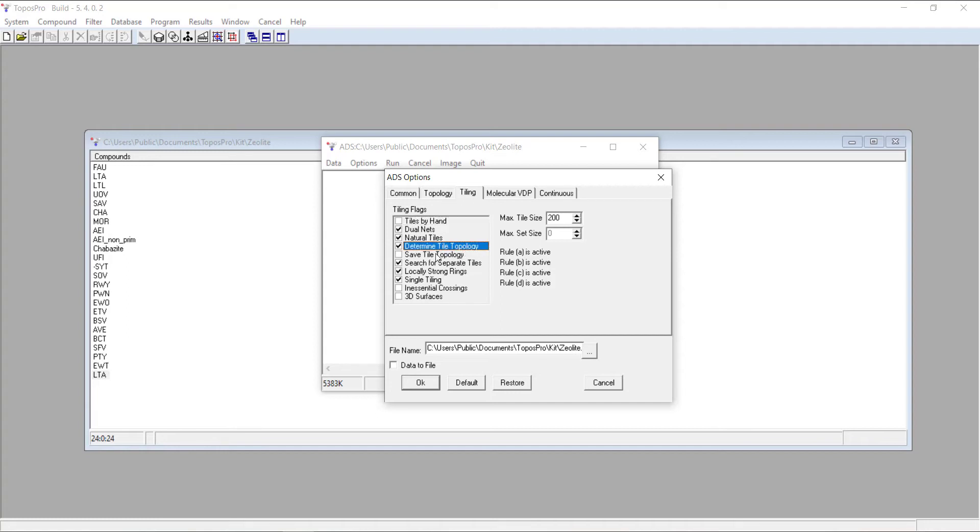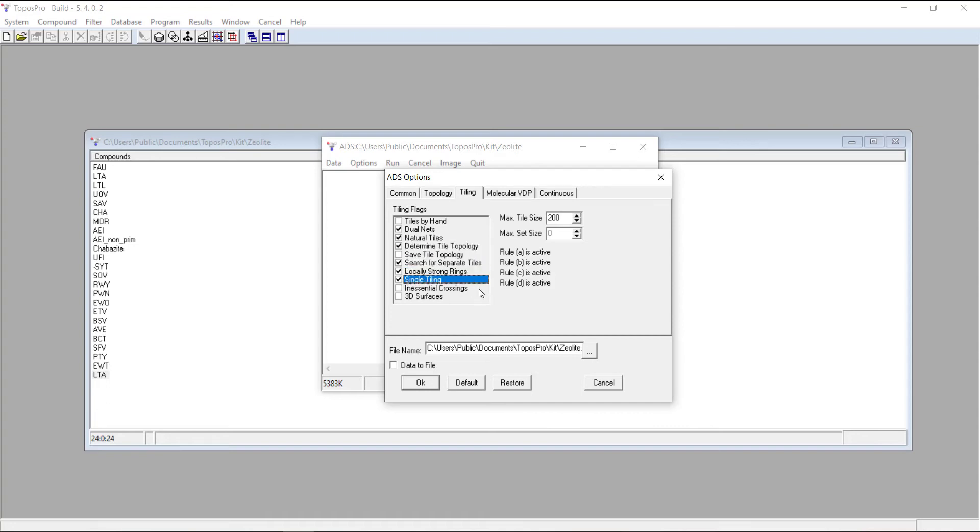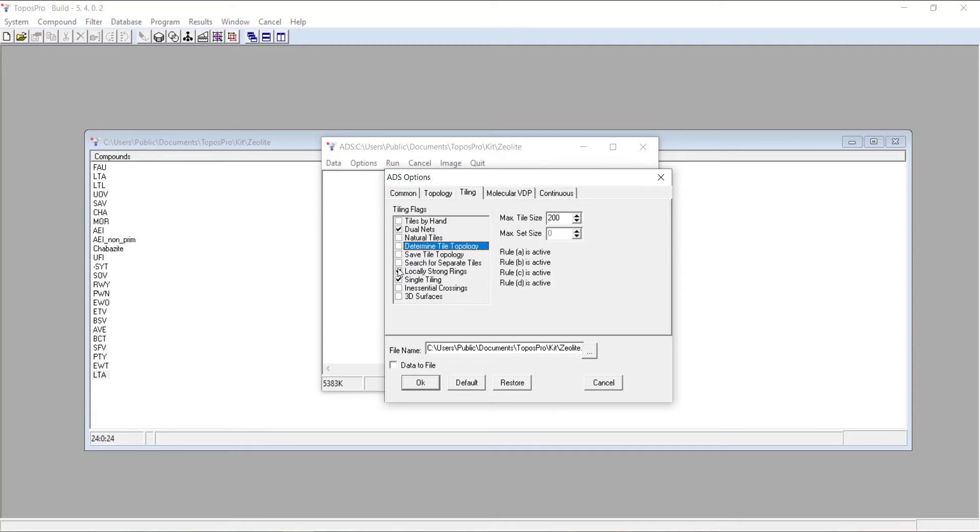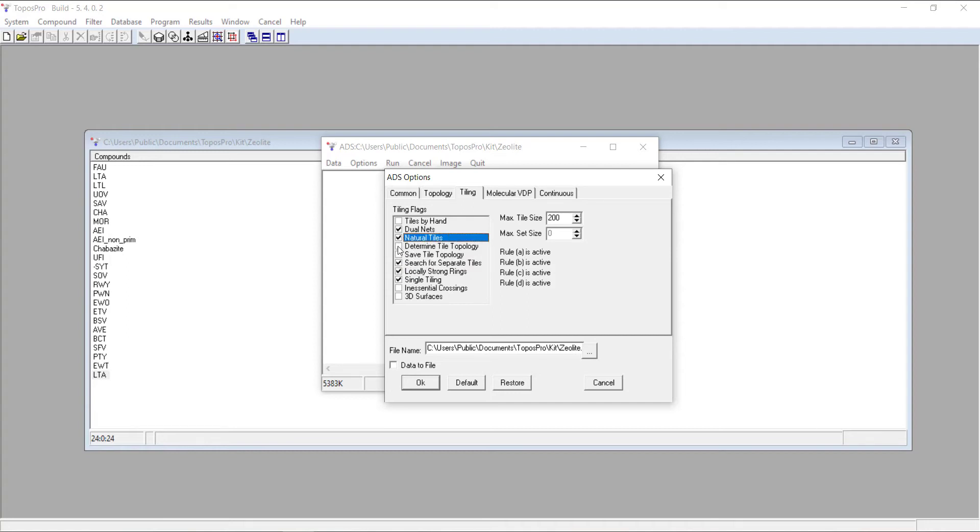Determine tile topology will give you the correct names of your tiles in your structure file rather than just calling them tile number one, number two. Search for separate tiles, locally strong rings, and single tiling. You can see as you disable or enable these options, certain rules get enabled and disabled. We want all four of those rules when we're calculating a natural tiling.